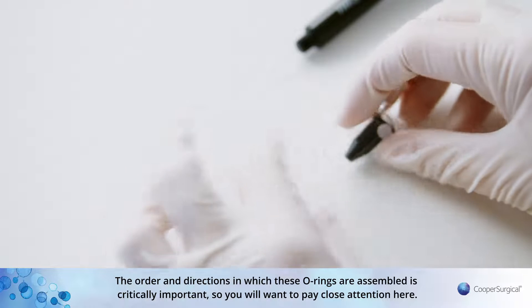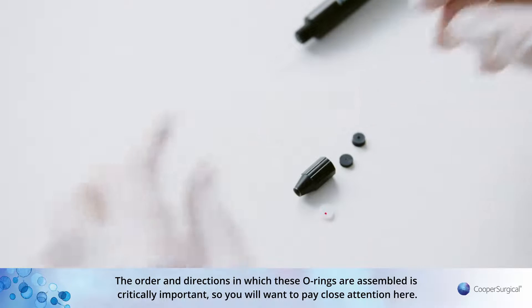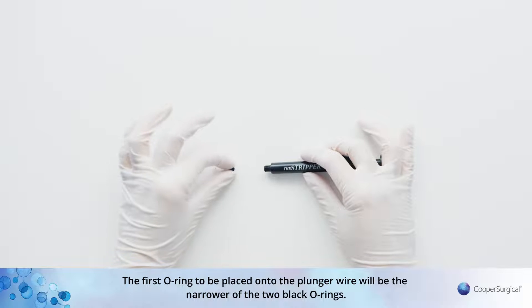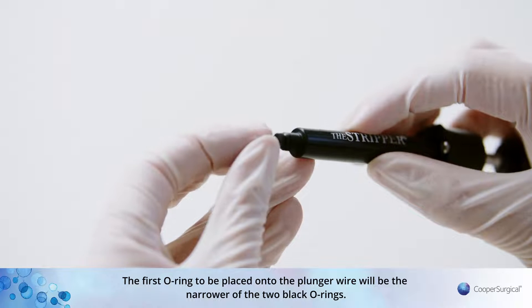The order and direction in which these O-rings are assembled is critically important, so you will want to pay close attention here. The first O-ring to be placed onto the plunger wire will be the narrower of the two black O-rings.